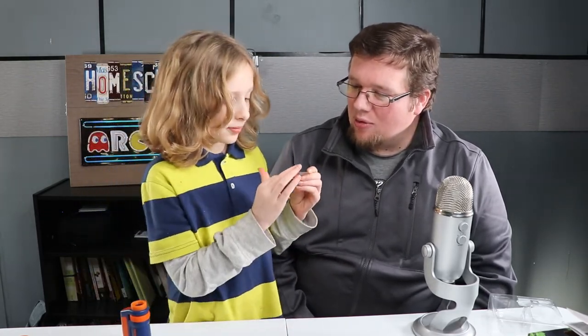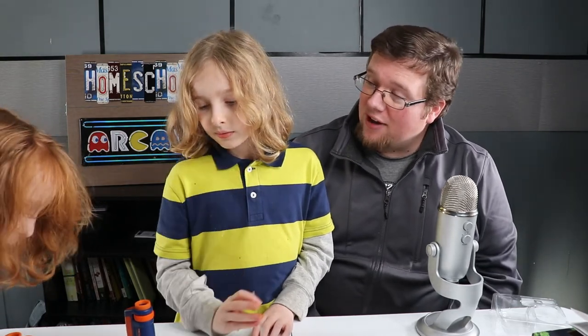So what do you think about the microscope, Celia? It's really cool. What did you like about it? I just like nature, so I'm just into that kind of thing. Did you get to look at some things really close? This is my favorite one because it has all the tiny itsy-bitsy hexagons on it. Which one is that? It says dragonfly compound eye. So the dragonfly eye is really cool to you — well, that's neat. Because it has all these itsy-bitsy hexagons that are smaller than I can make.